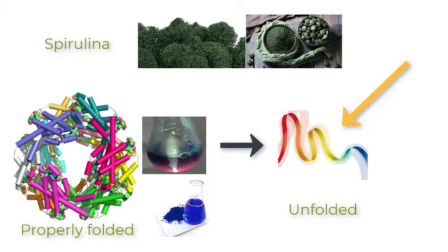One of the proteins that we'll be using in this experiment that can demonstrate these properties is phycocyanin. This is a conjugated globular protein which has several chains of amino acids along with chromophores. Chromophores are light-harvesting organic molecules. It's part of the photosystem II complex found in cyanobacteria, which plays an important part in photosynthesis that green algae can use to convert sunlight to energy.